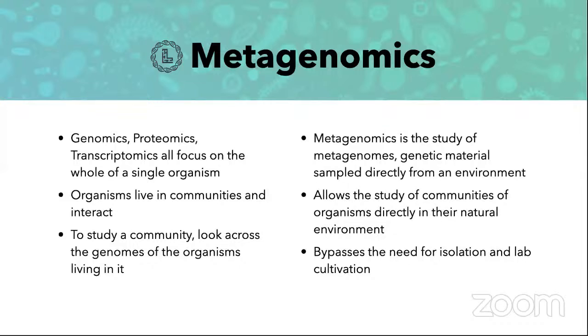And this is important because only 1 to 2% of bacteria can be cultured in the lab, and the ability to identify microbes without a priori knowledge of what the sample contains is opening new doors in disciplines like microbial ecology, virology, microbiology, environmental sciences, and biomedical research. So at the foundational level, we are talking about sequences that define diversity in the whole population in that sample.